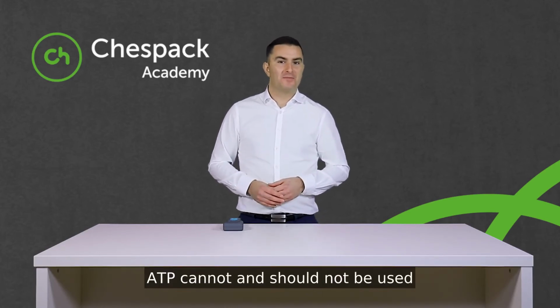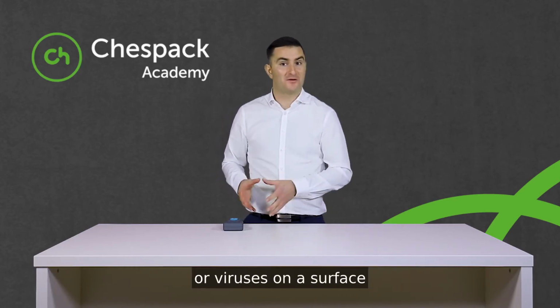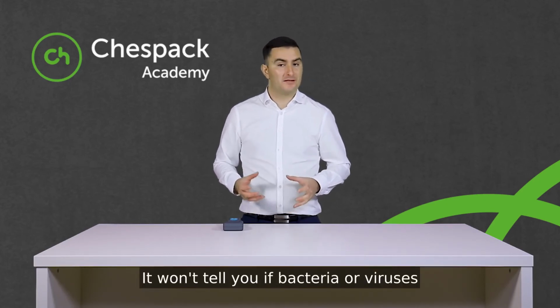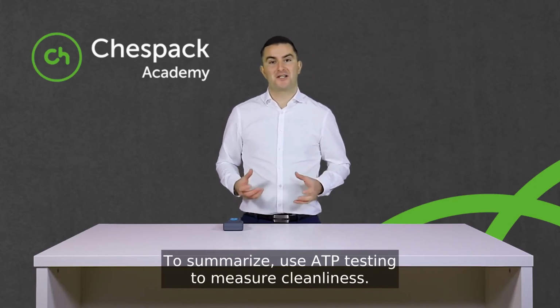ATP cannot and should not be used as a tool to show a reduction of bacteria or viruses on a surface, because it's a measure of organic matter only. It won't tell you if bacteria or viruses have been reduced. To summarise, use ATP testing to measure cleanliness.